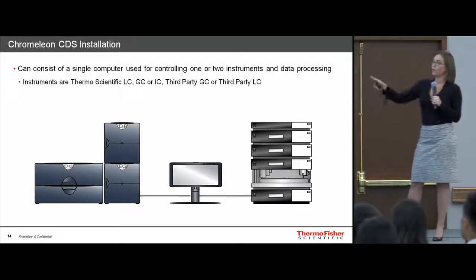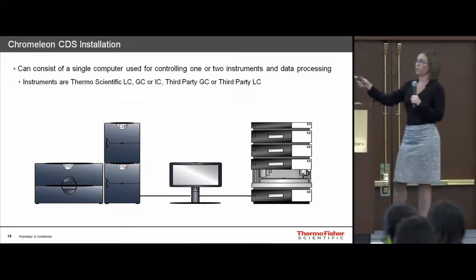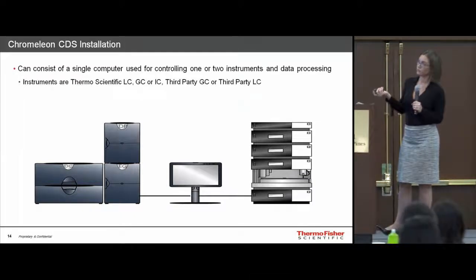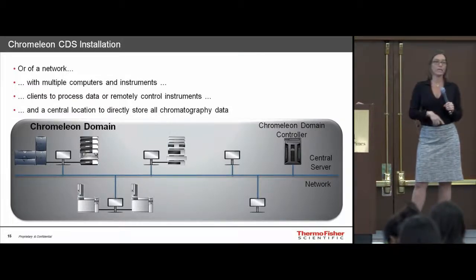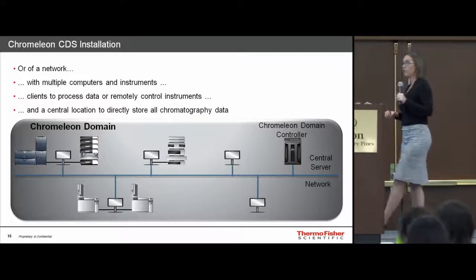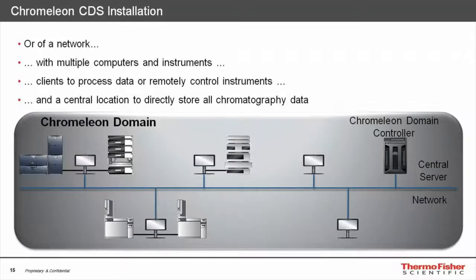The installation. As most of you already know, it can consist of a single computer. You can control the instruments and data process right there locally. However, you can also have a network install, where you can have multiple instruments, multiple computers, everything going to a central data vault. Your admin's in one place, your data's in one place, you manage it once, and you push it out to all your computers. You can work from home, you can work from your desk, you can see what the instruments are doing, you can stop a run on the weekend if you have to work on the weekend, which many of us do. You can process from anywhere, report from anywhere, so that's a really nice function.